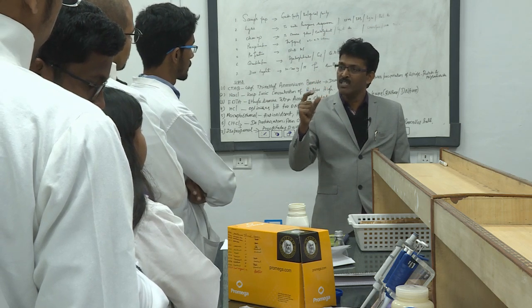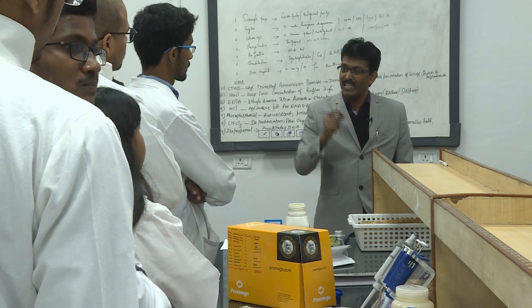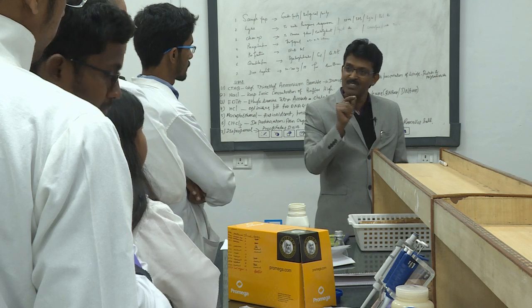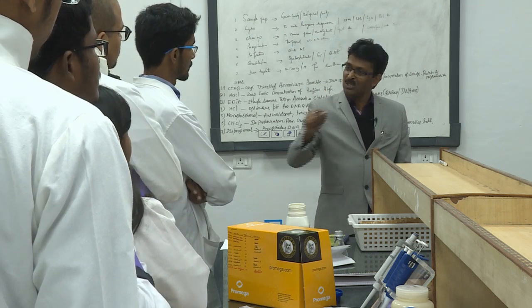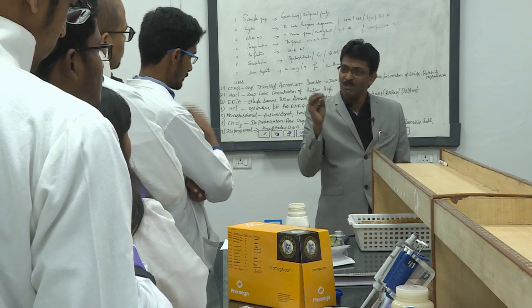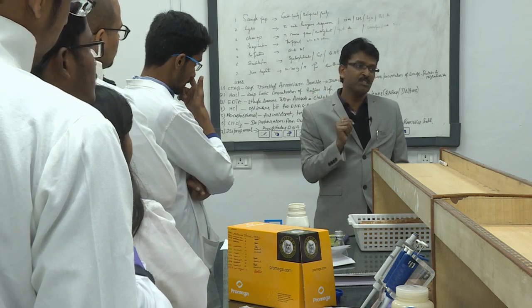And this filter is preserved at -20, and any time you can retrieve it. Each disc is loaded with the spores, and you just spot it on the plate in the center, and within another 3-4 days you will see the beautiful colony emerging, right? So, this is the method of preservation.